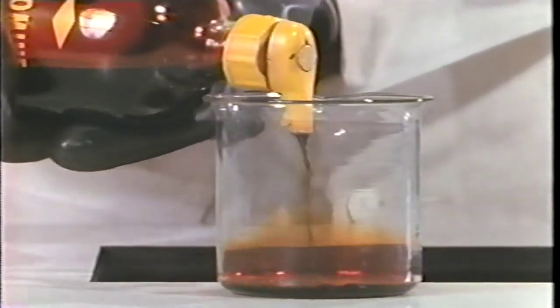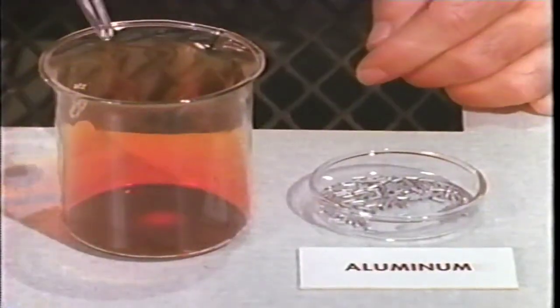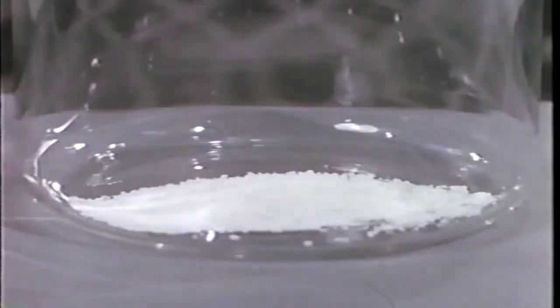Now, to another sample of bromine, let's add aluminum. Not much happens at first. But once the oxide coating on the aluminum is penetrated, the two elements react vigorously. Similar experiments would show that bromine reacts with most elements. Here, the aluminum and bromine combine to form aluminum bromide, which, when purified, gives this solid.